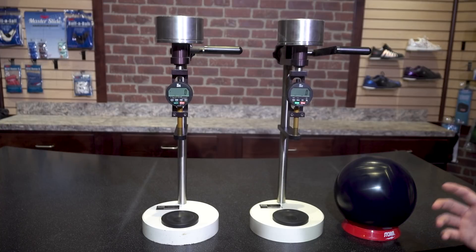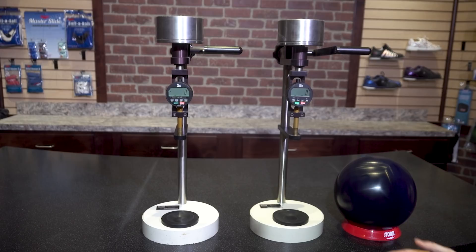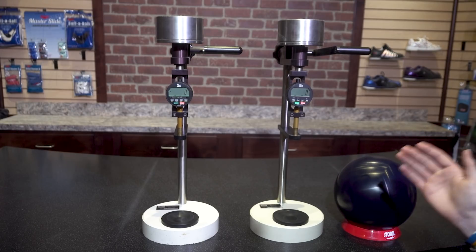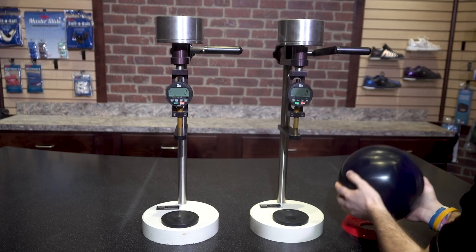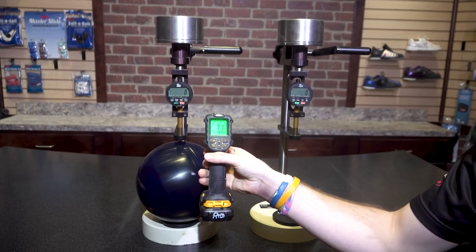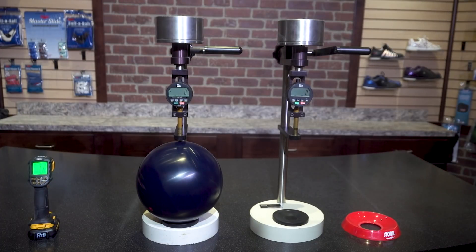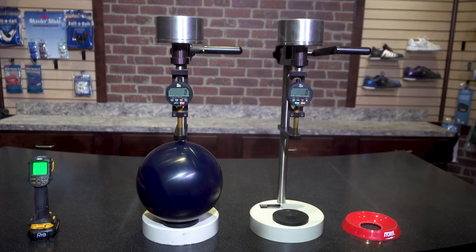The purpose of this test is to show you the natural variances and tolerances allowed in two properly calibrated durometers. Both durometers have been verified and calibrated by the manufacturing company and are both currently in calibration. We'll start with the durometer on the left. Let's verify that this ball falls within the temperature range — we can see it's about 71 degrees, so it falls within the range. We are going to measure this ball 10 times in different spots and see what the average hardness is.